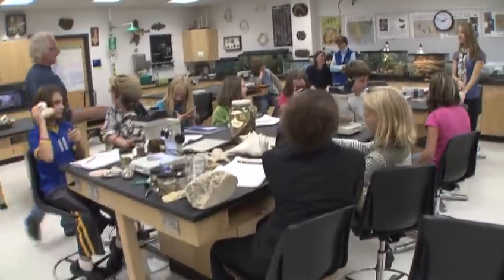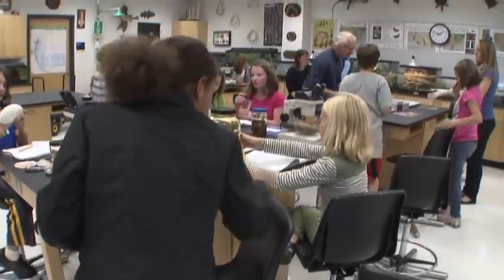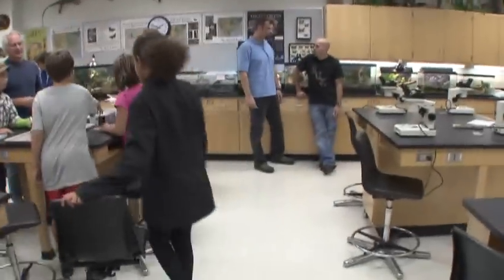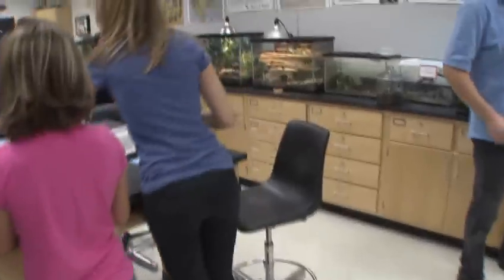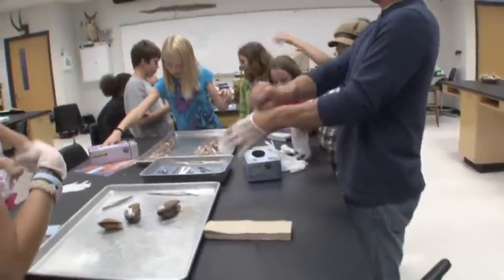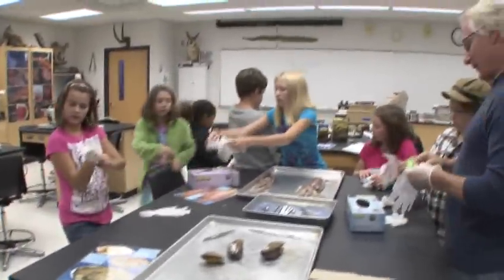You guys have to get gloves on too, just like you're in the operating room. I've got these other smalls over here. Okay, get the smalls on. You might have to get a large. Here, take a large. I need a small. Take a large. I only need this small, so I'm not going to use it. Now I'm going to give you guys jobs to do. Like when I cut off things, I'm going to have you take them over to the microscope. Is this a large too?